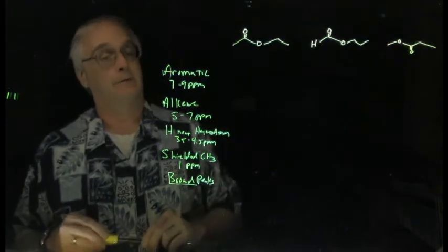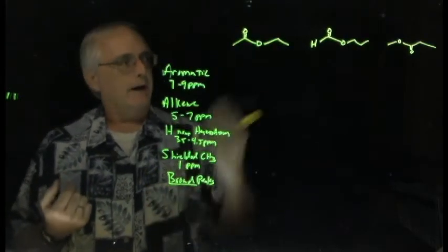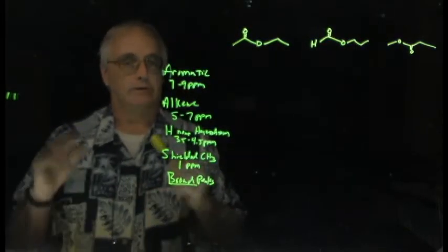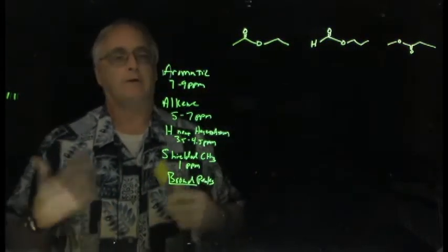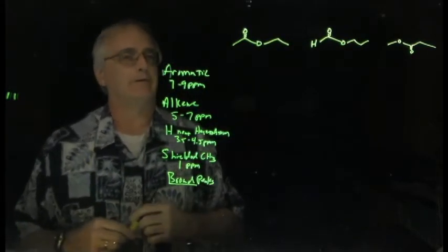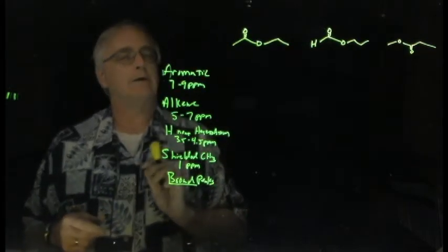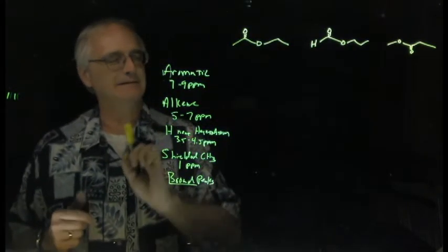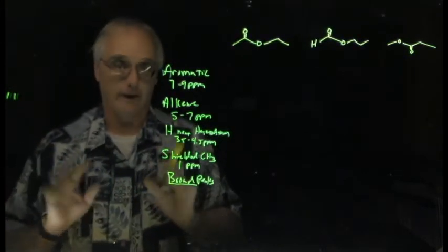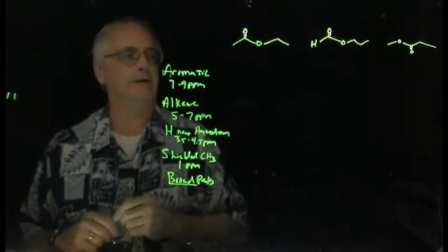Now we've got 3 of them to look at. So we have a collection of 3 proton spectra and 3 molecules, and we have to match up which spectrum 1 is which molecule, spectrum 2 is which other molecule, and so forth. Again, our 5 best friends are going to really help us here, but this one is going to require slightly more intuition in our growing knowledge of NMR spectroscopy to really nail this one down. It's kind of an interesting one.